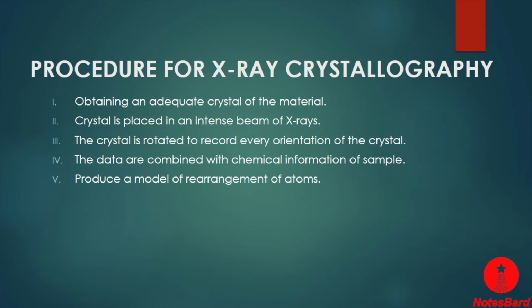So after the diffraction pattern is obtained, the data is then processed with the help of computers and other systems, and the structure of the atom or the molecule is visualized. So this is the procedure for X-ray crystallography.